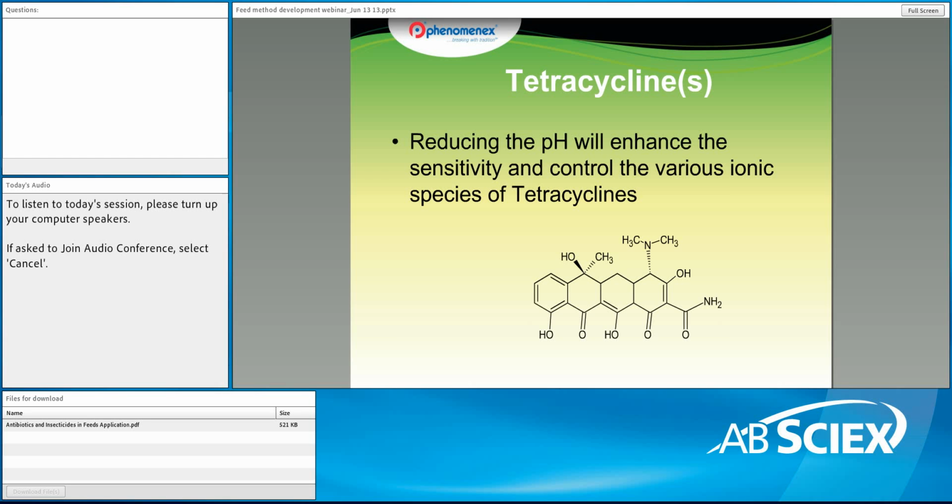If you take a look at this compound, it has multitudes of functional groups that can act as chelating agents, host either an acidic proton or sodium, or stick to silica, making chromatography a little bit more difficult.